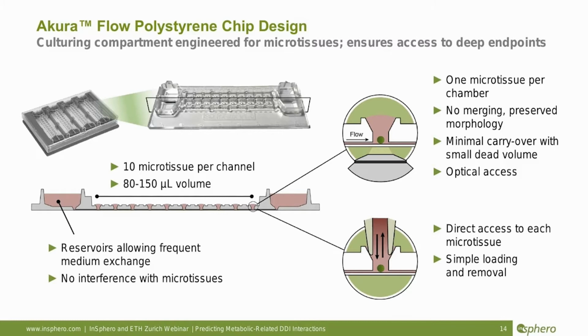A very important part in this compartment is that we have direct access to the microtissue. So we can load the microtissue from the top into the compartment using this funnel-like structure where the tip is positioned, and we can remove the microtissue after an experiment for downstream analysis.